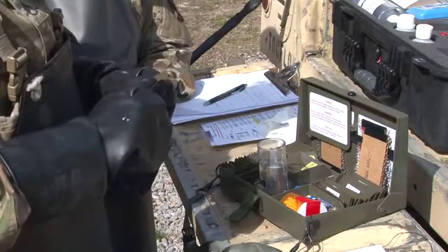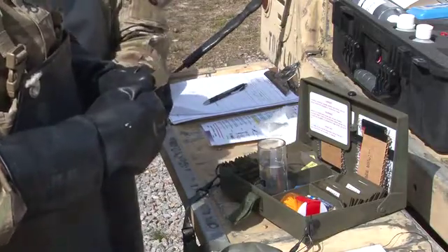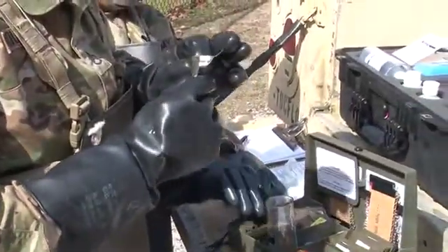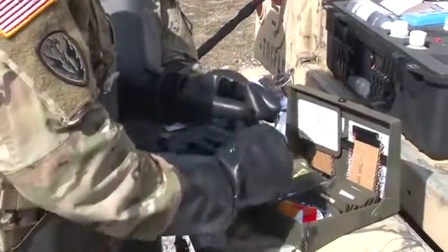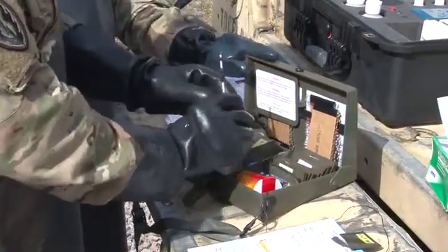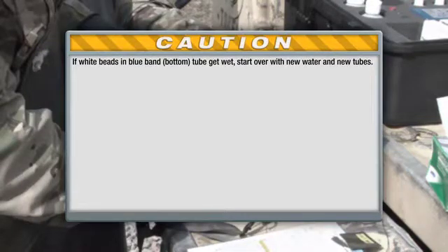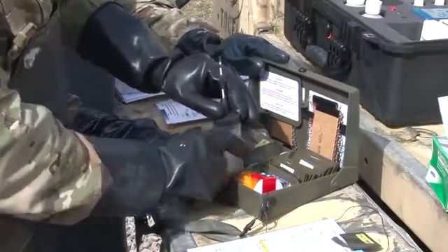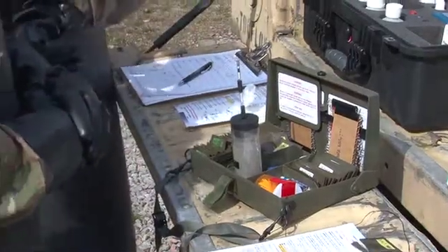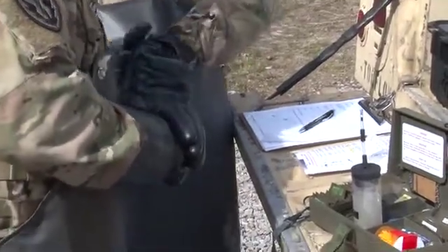However, if your water temperature was between 50 degrees and 105 degrees Fahrenheit, then you may proceed with adding the tablets to the water. Tear the green label packet open at the notches. Add 2 tablets from the packet to your water sample. Insert the stopper assembly firmly onto the bottle. Now you'll use your watch or your timer and wait a full 5 minutes, and if your water is colder than 50 degrees Fahrenheit, you will wait a full 10 minutes.